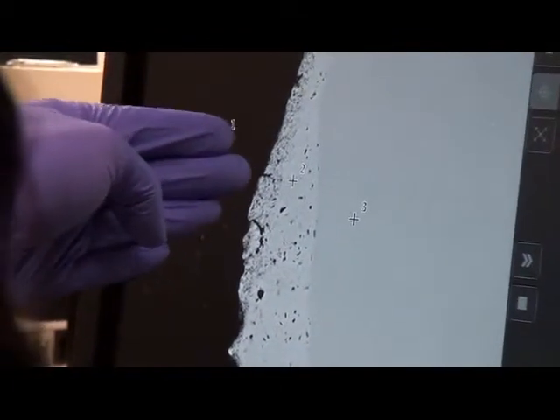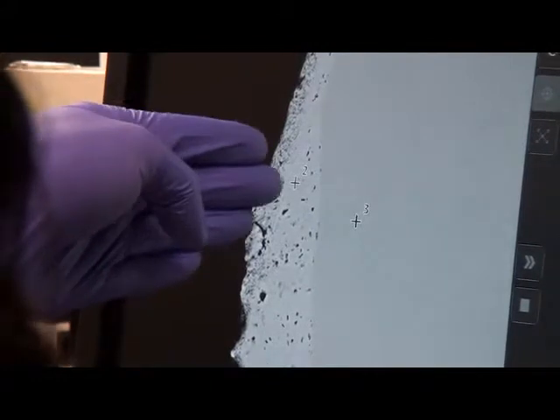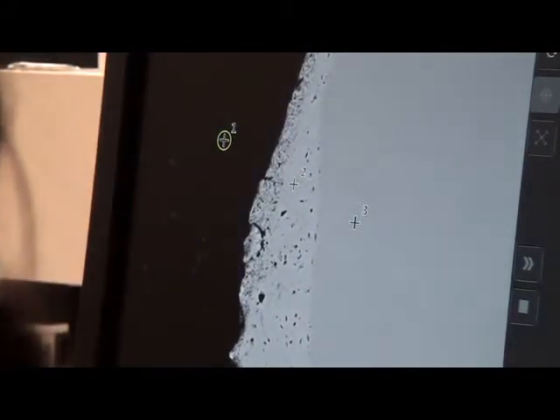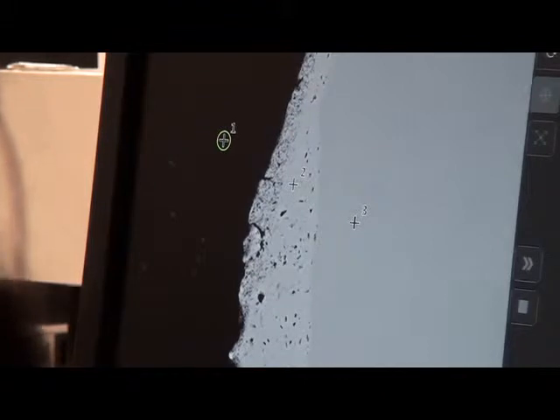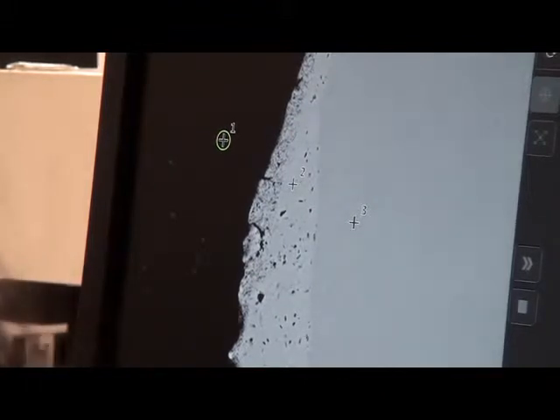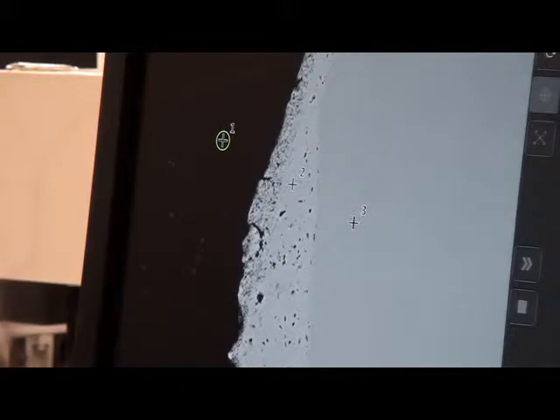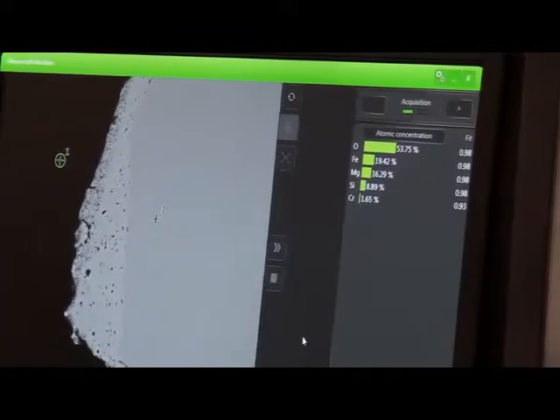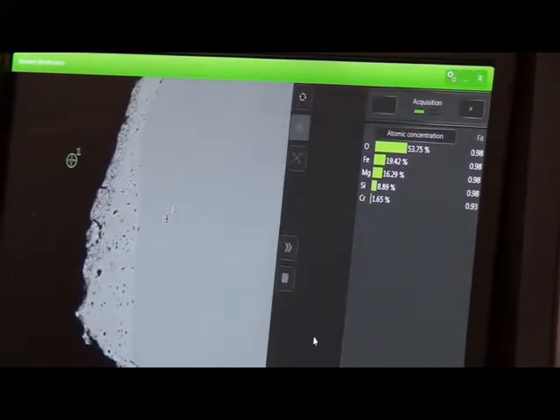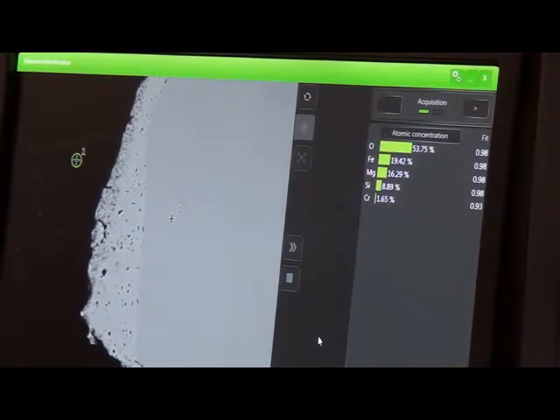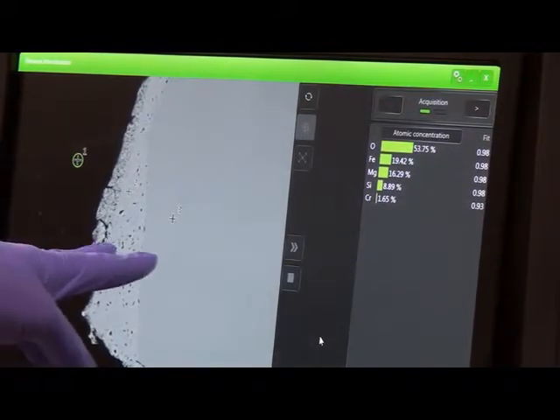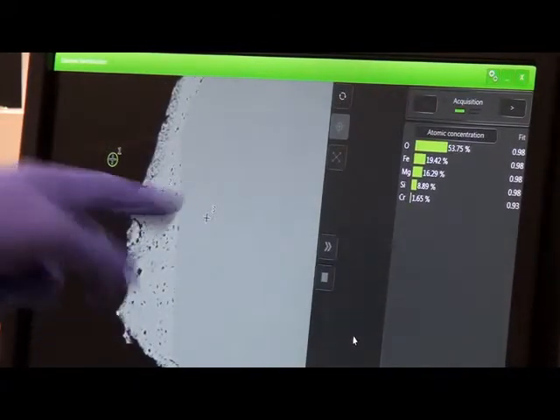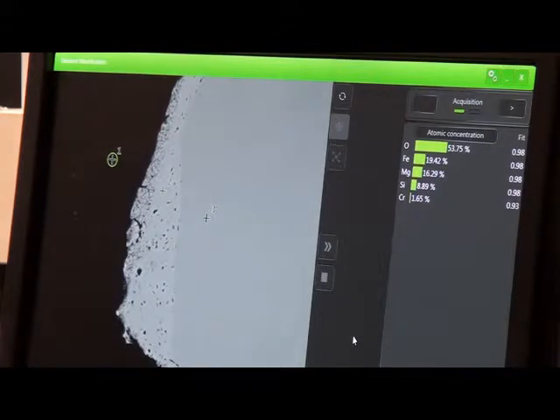And you're actually slowly seeing a chemical reaction take place in the solid state, although there's a small amount of fluids present that might be aiding it. But this is actually a solid state reaction. It is a chemical reaction within a solid changing from one to another. But it's the same as every other chemical reaction you studied in chemistry class. And what you're seeing is that this oxide is actually reacting and turning into a new phase.